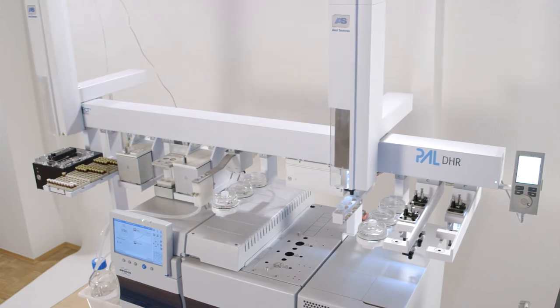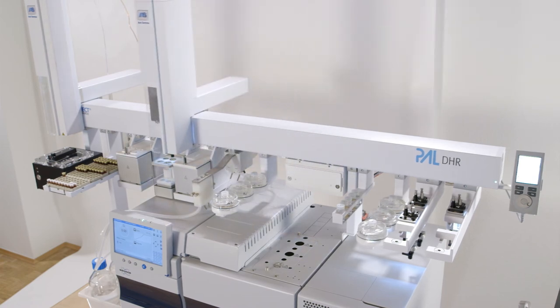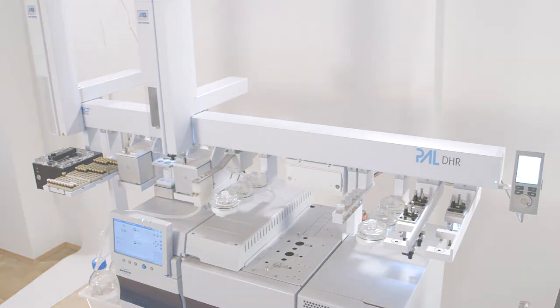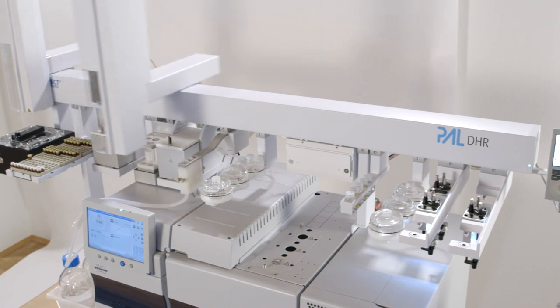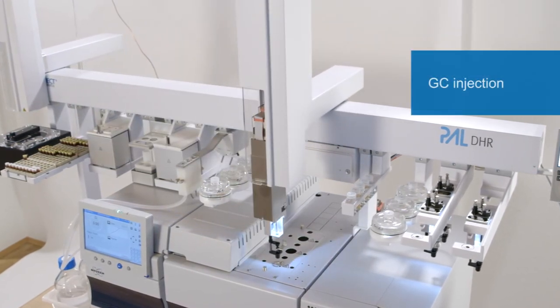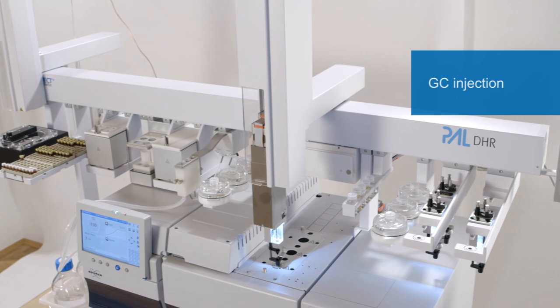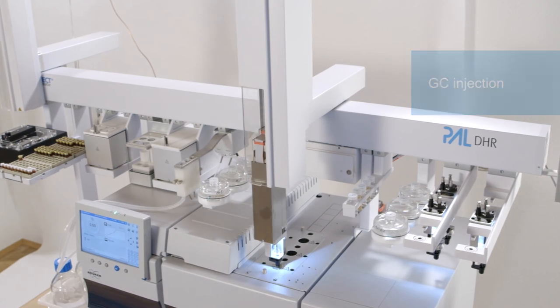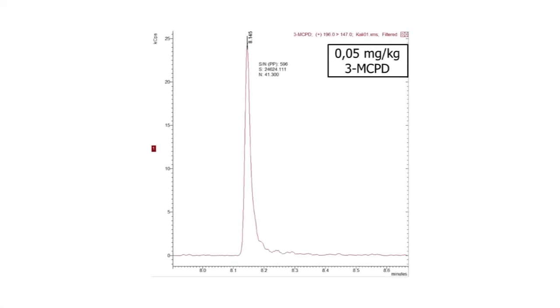Excellent reproducibility is given. Washing steps avoid carryovers, and the detector is relieved by clean samples. Direct coupling to GC-TQMS allows for low detection limits — down to 0.05 mg per kg, 3-MCPD can be detected cleanly.